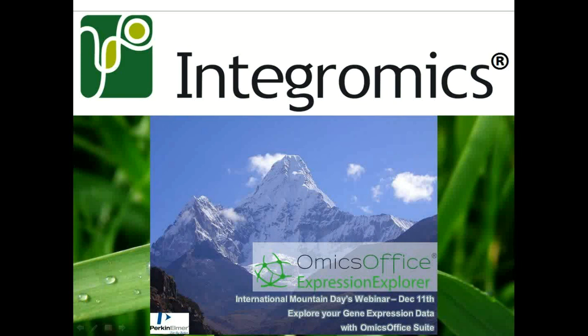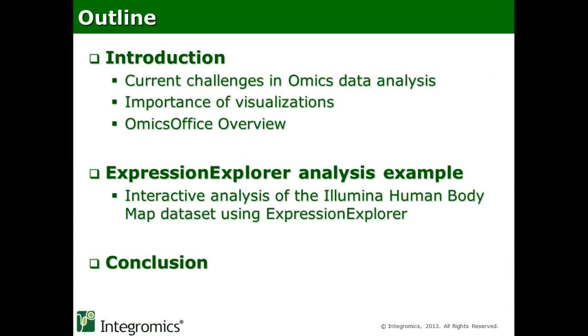Okay, so let's start by having a look at the overview of what we will be seeing today. First, we will go through an outline of what we will be viewing today. So we will start with some of the current challenges present in the omics data analysis. We will speak a bit about the importance of the visualization in this type of analysis. And also, we'll go through an overview of OmicsOffice.